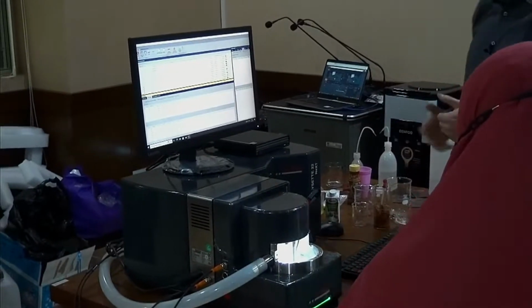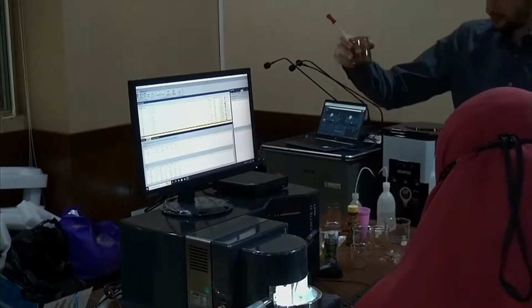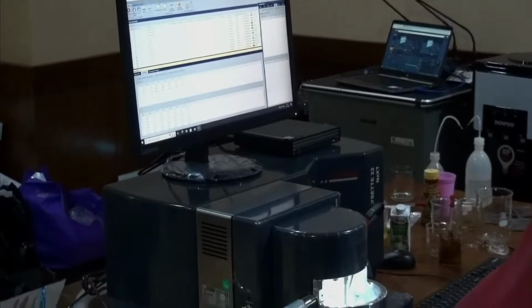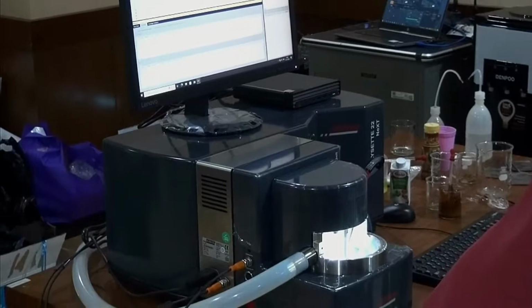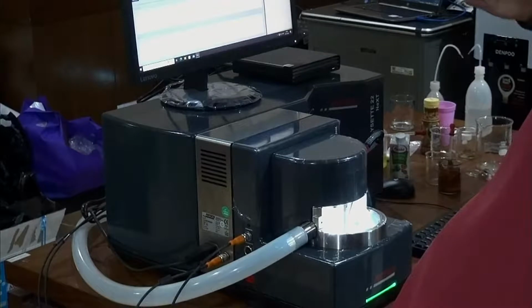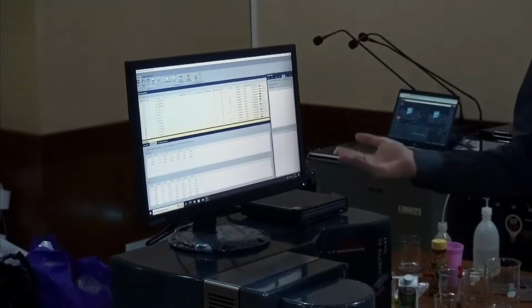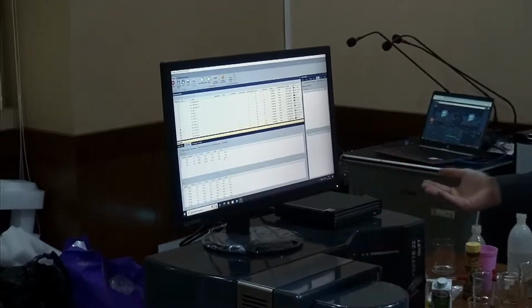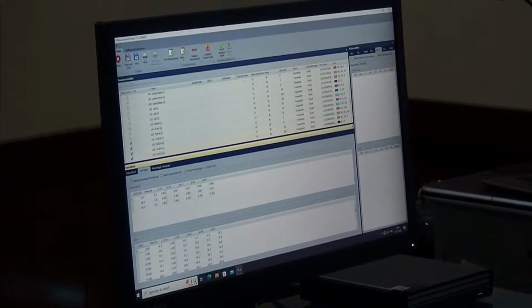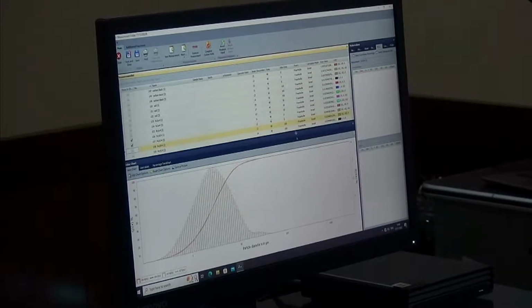That would be a nice research project for a master thesis or so, to explore the effect of ultrasonic on your material. Clearly there's some, but of course, in this case, what I would do most likely, I would do a couple more experiments, but the point where I'm now, I would guess I would just measure this without ultrasonic, obviously, because it does have an effect, and it seems to have an effect which is one we do not want. Yeah. So apart from that, it actually doesn't look all that bad. So we take these. This would be then without ultrasonic the way we would measure this.